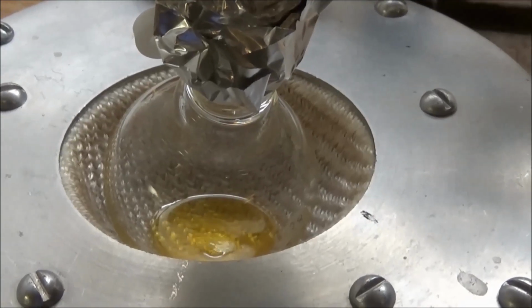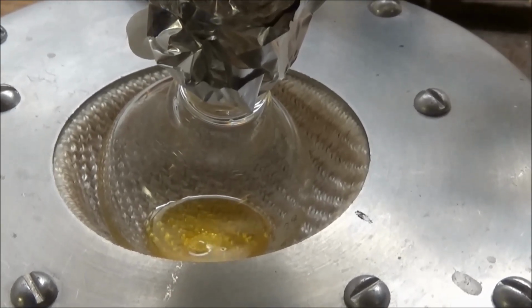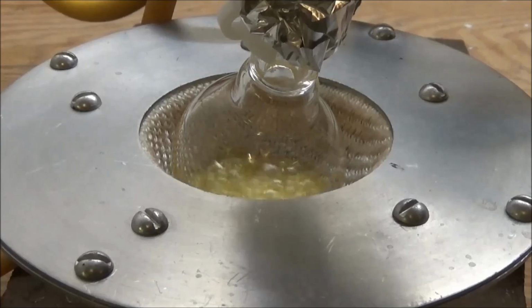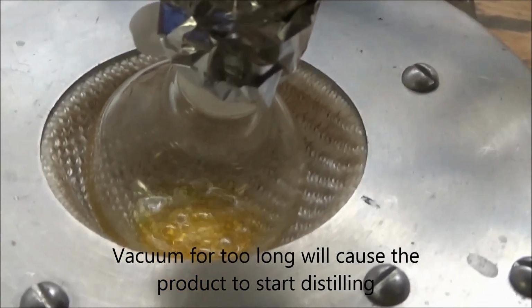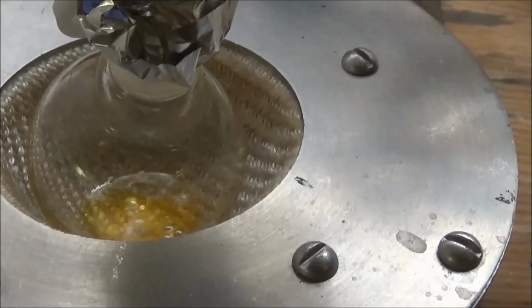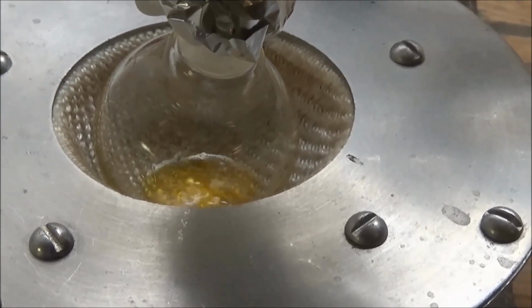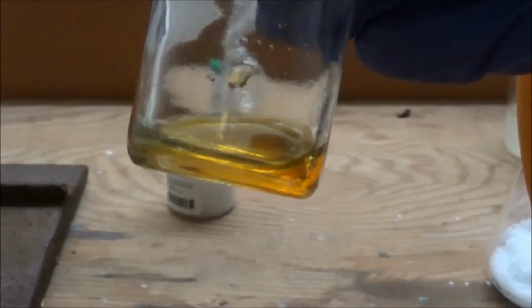Eventually, nothing more came over and boiling ceased. I then applied vacuum for a few minutes to remove the last bits of toluene. And the final step was pipetting the still warm solution into a clean bottle.